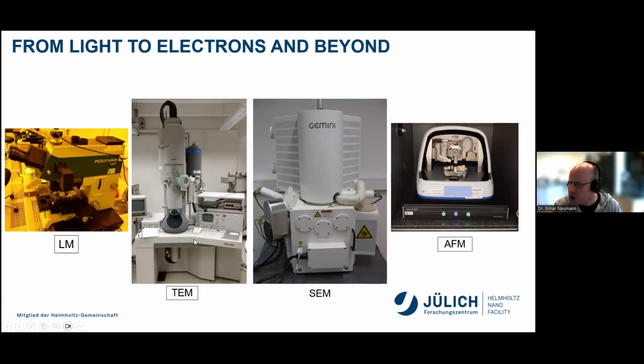It's quite large. Under this lid is the screen where you can observe all your images, also with a small light microscope here. Your sample goes in here. That makes the sample size very small, about 3 millimeters in diameter, but we will come to this a little later.